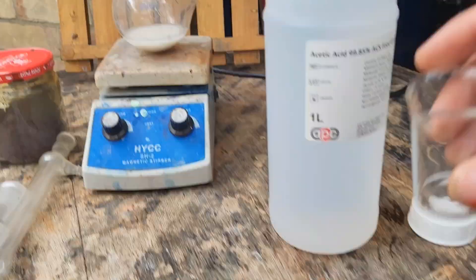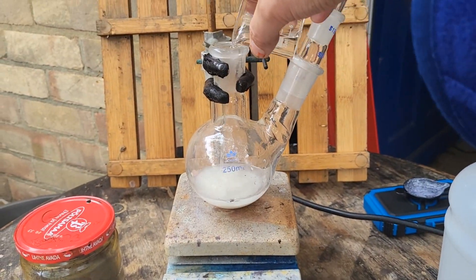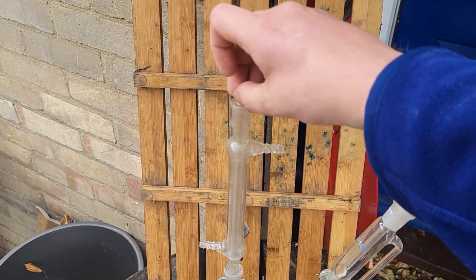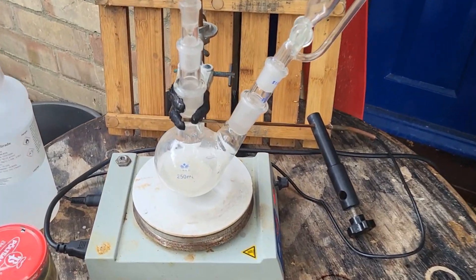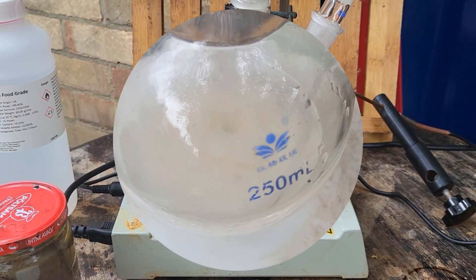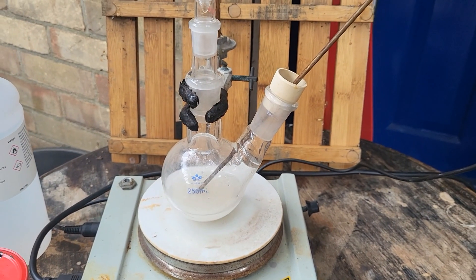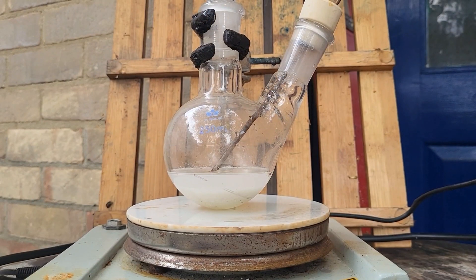25 ml, followed by another 25 ml. A little stir bar. Turn the heating on as well — the heating probe. The acetic acid is not strong enough to attack the stainless steel of the temperature probe. As this warms, it should dissolve.